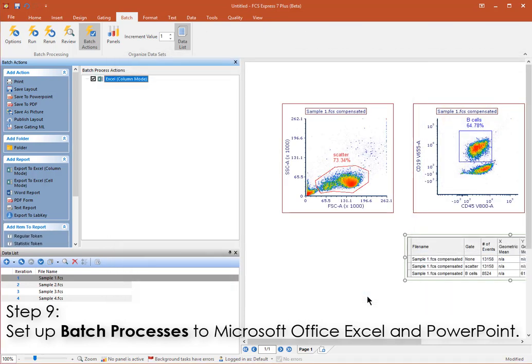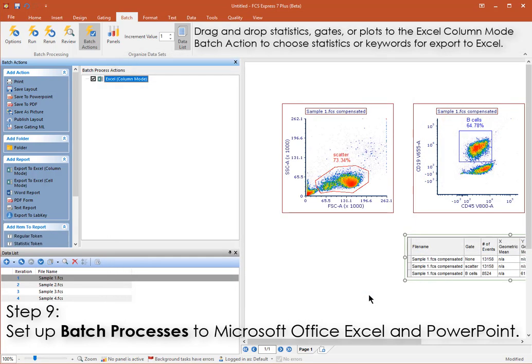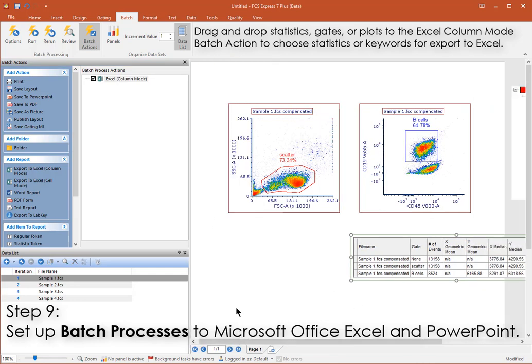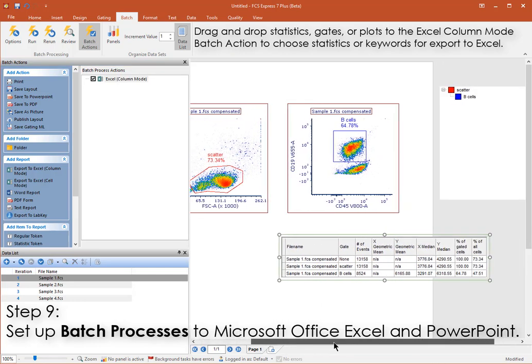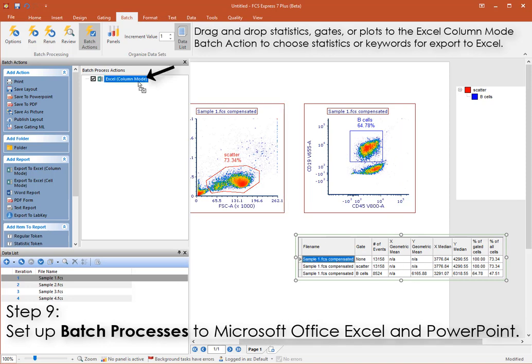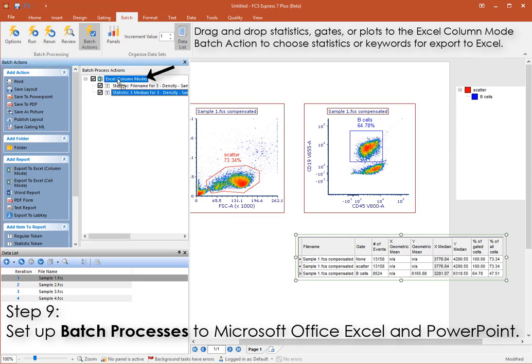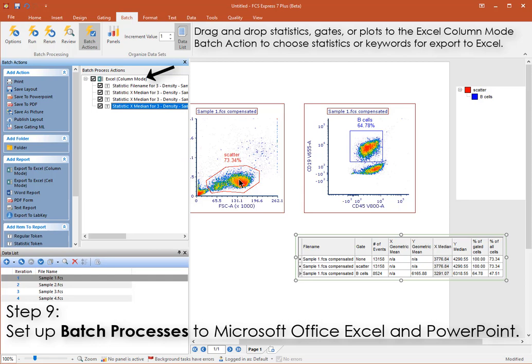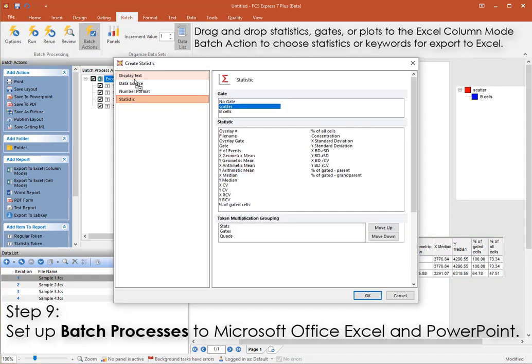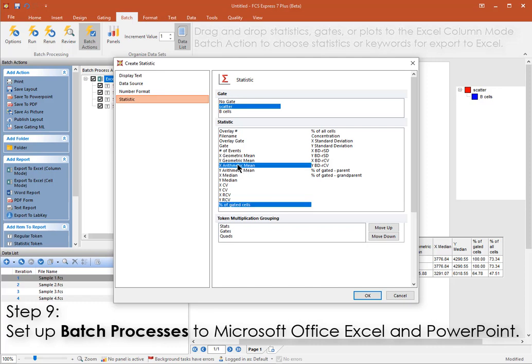Now you can choose which statistics and file names or other metadata you'd like to export to Excel. You can drag and drop items from the default statistics window, or you can drag and drop plots and gates to the Excel batch action, in which case you can choose which statistics you'd like to export for that particular population.